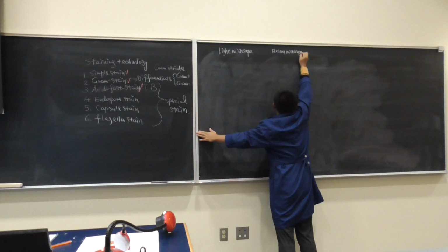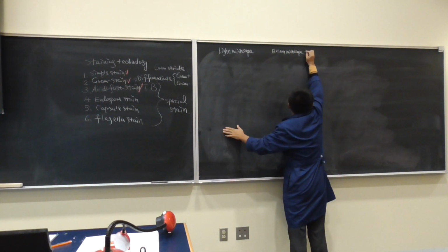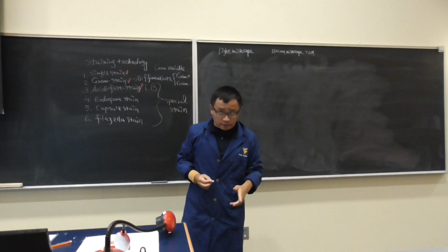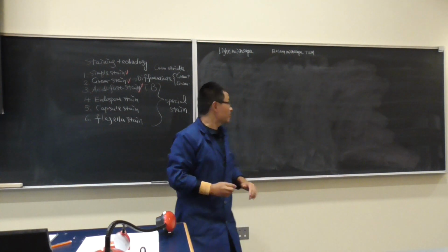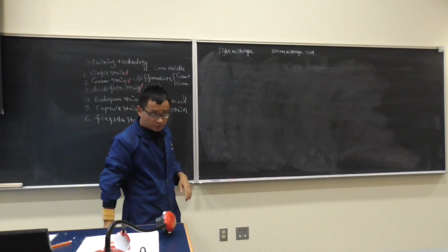We will use the example of TEM, which means transmission electron microscope, which lets us see the internal structure. The scanning electron microscope we will mention briefly, because that only shows the surface, to see 3D images. So if you still remember in the lab what the light microscope looks like.